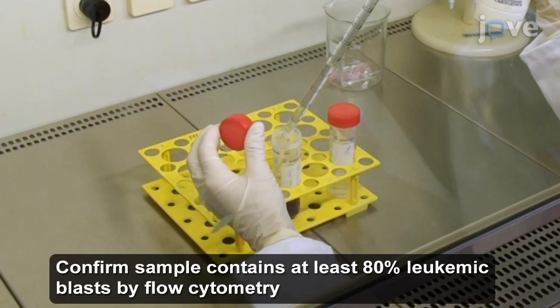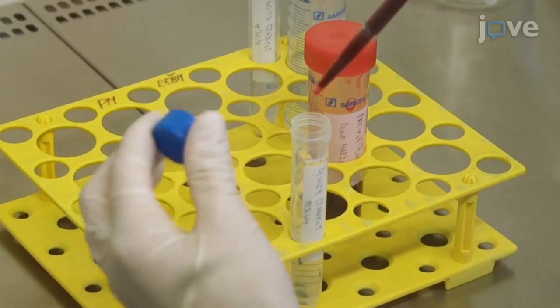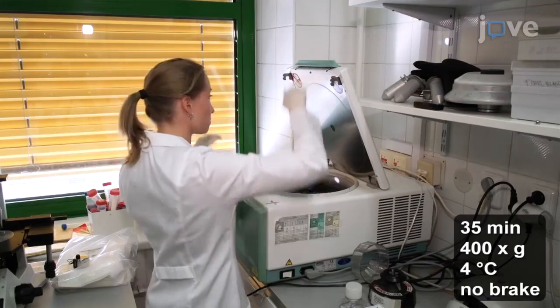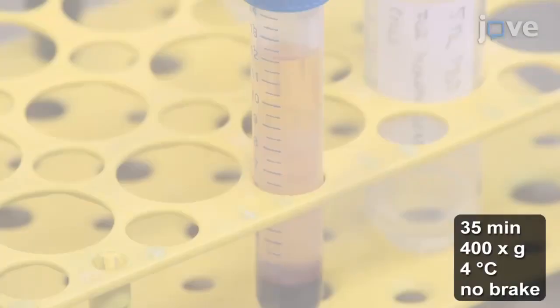Begin by diluting a bone marrow sample obtained from a leukemia patient in PBS at a 1 to 1 ratio. Carefully layer 6 mL of the diluted bone marrow sample over 6 mL of freshly prepared density gradient medium in a 15 mL conical tube, and separate the cells by density gradient centrifugation.